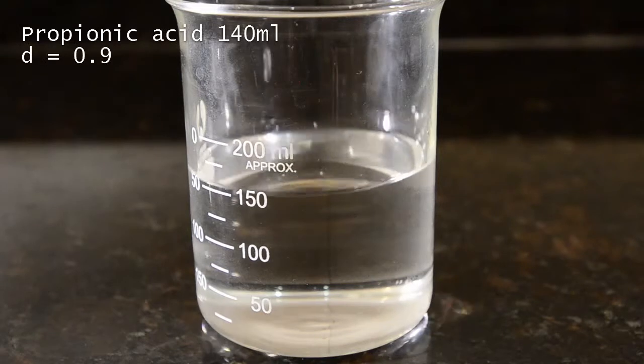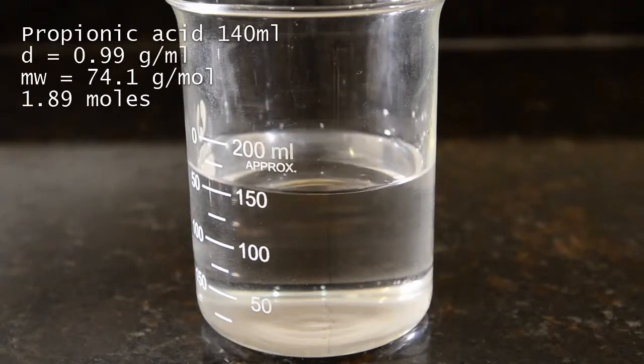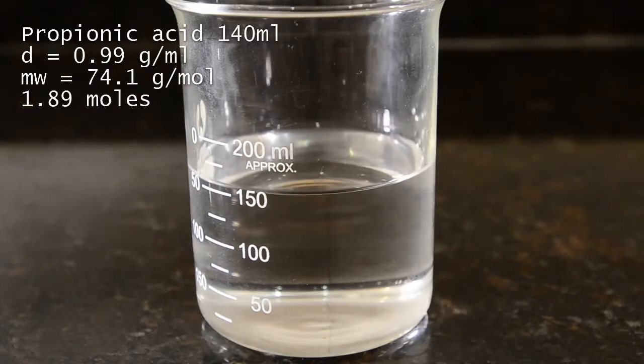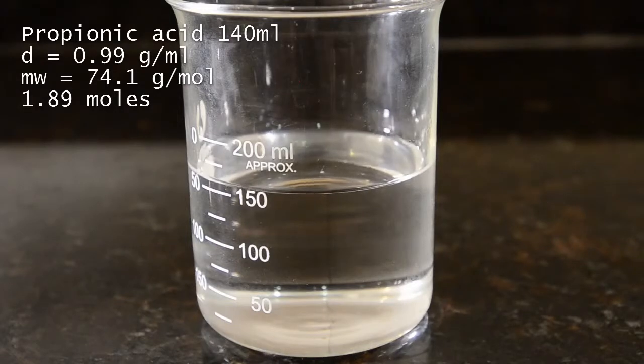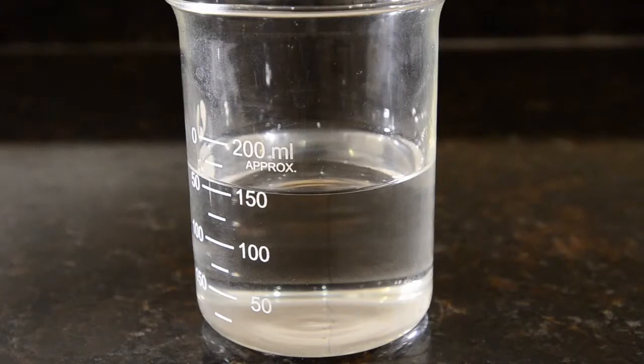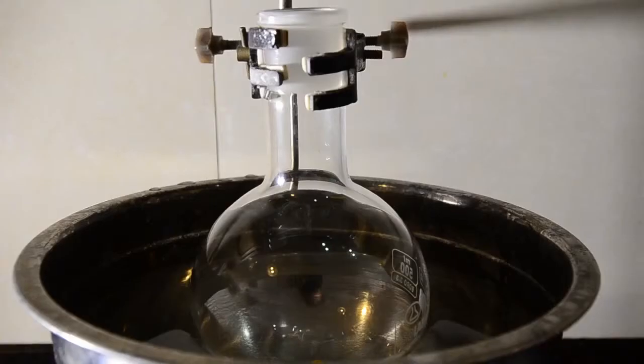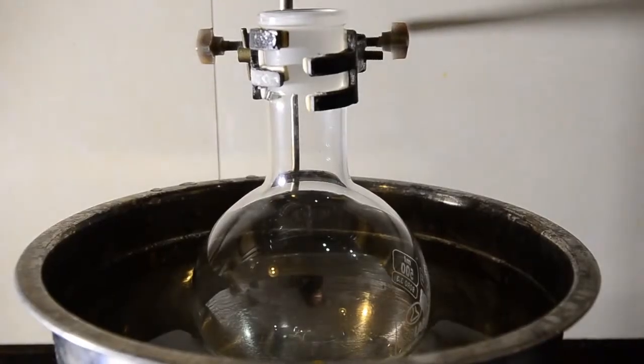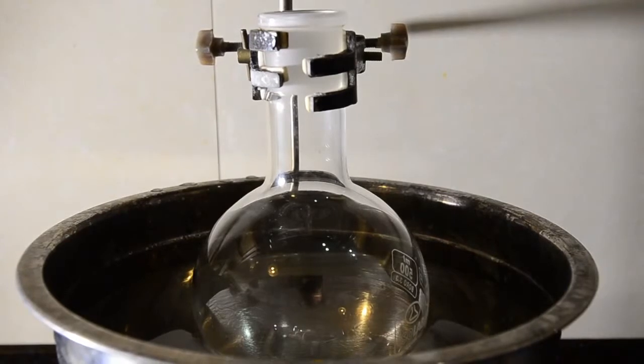We are going to prepare propionyl chloride. First, measure out 140 ml of liquid propionic acid as anhydrous as possible. Set up a 500 ml round bottomed flask on a water bath at room temperature. This needs to have very good ventilation.